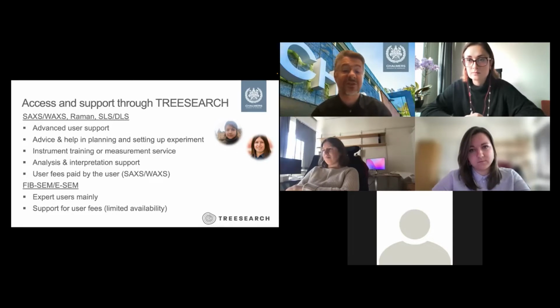For FIBSEM and ESEM, here we mainly accept expert users because we don't have the advanced user support on site. So as you saw, the project that I demonstrated just a minute ago with Cecilia, Cecilia was really an expert user coming from KTH, but of course trained at Chalmers.